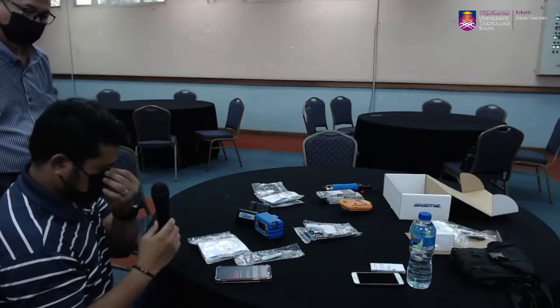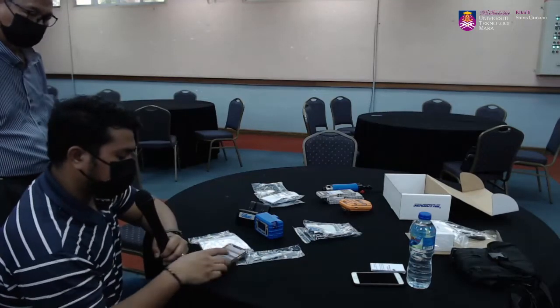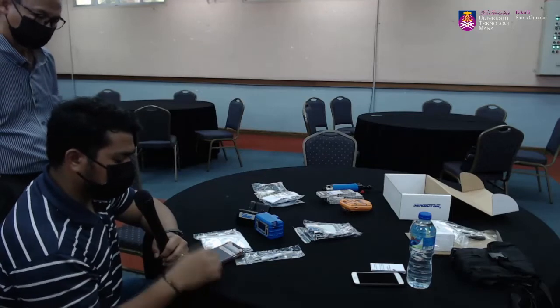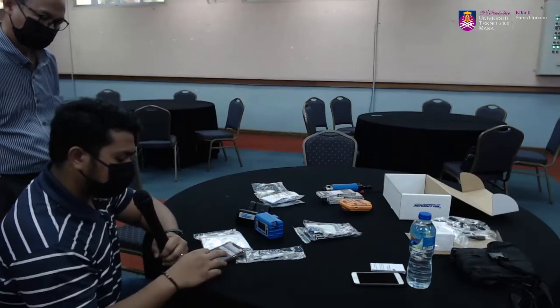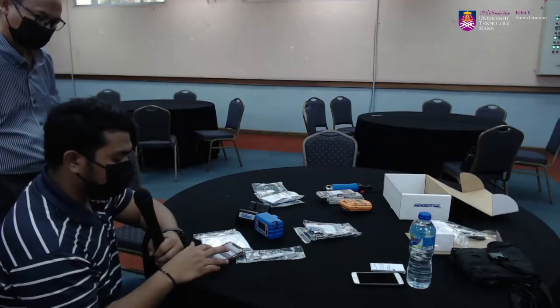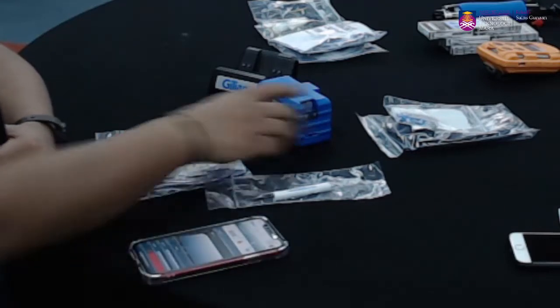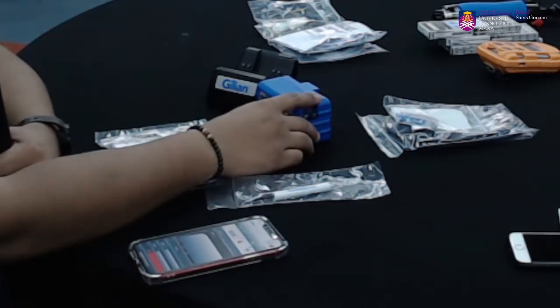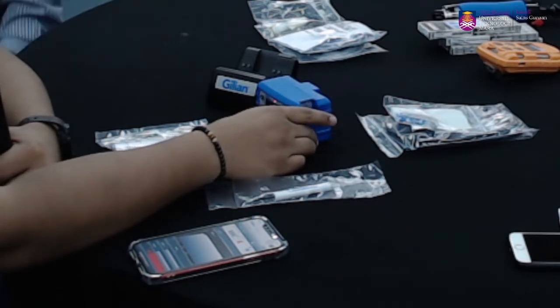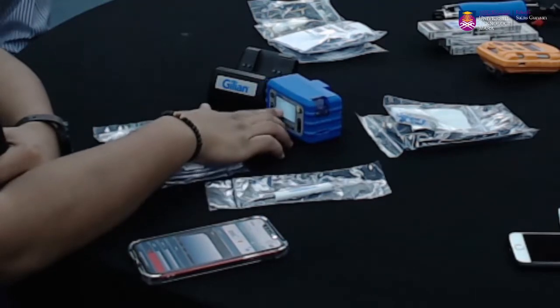Betul. Okay, so kalau contohnya based on application ni, kita boleh tengok in terms of back pressure, so far yang dia dah gone through. And then in terms of flow rate, berapa kita dah set in terms of 1000 to 999 cc per minute. So kita boleh tengok, kalau contohnya, saya tutup, nanti dia akan try to push balik and then dia dah bagi tahu kat sini in terms of fault.